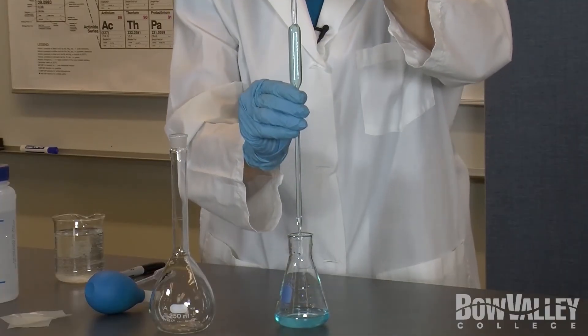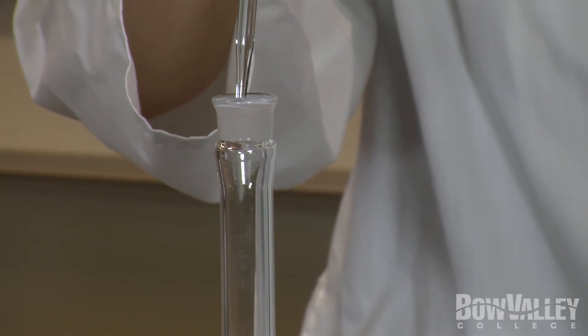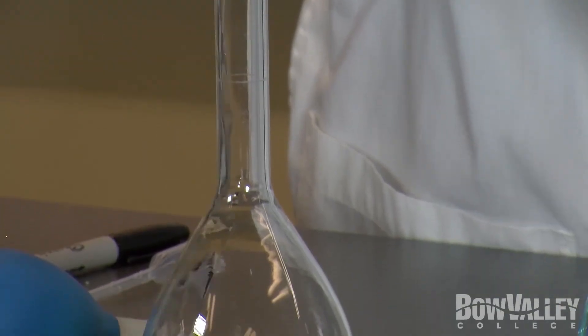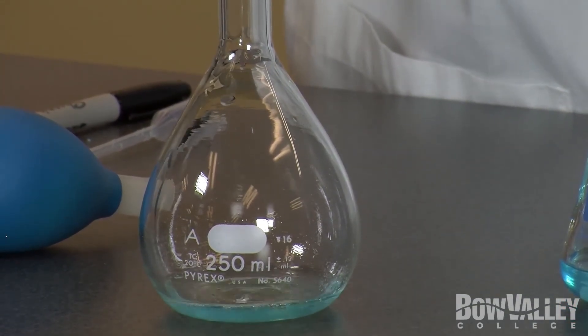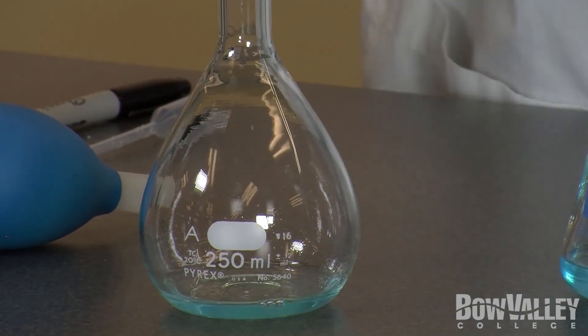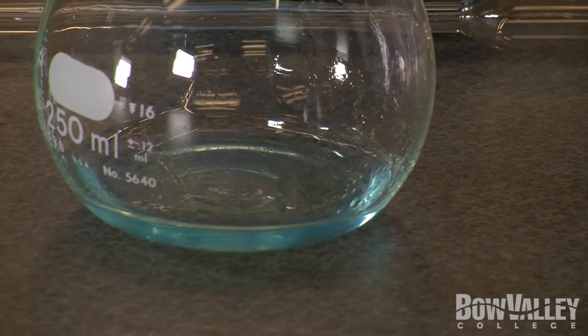Once you have the required amount of liquid, pull the pipette out of the Erlenmeyer flask and insert it into a new 0.250 litre volumetric flask. Remove your index finger from the end of the pipette and allow all the liquid to drain into the flask. Don't worry, if a few drops remain in the pipette, these are calibrated to deliver the exact amount of liquid required.